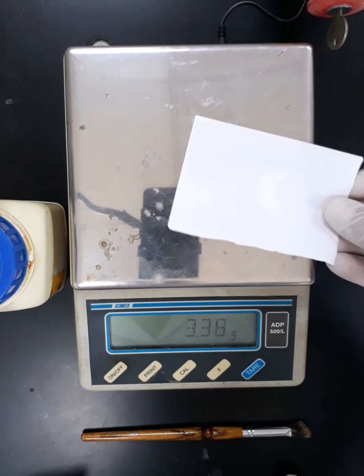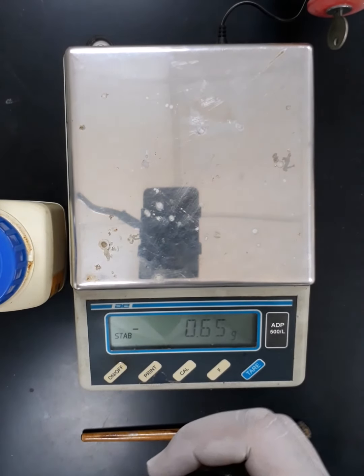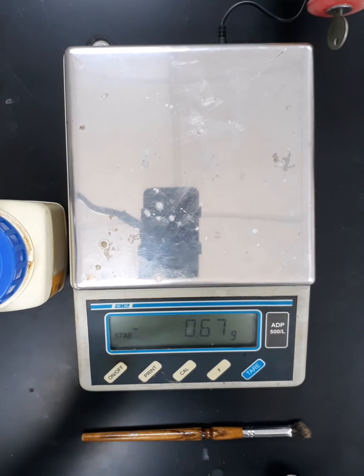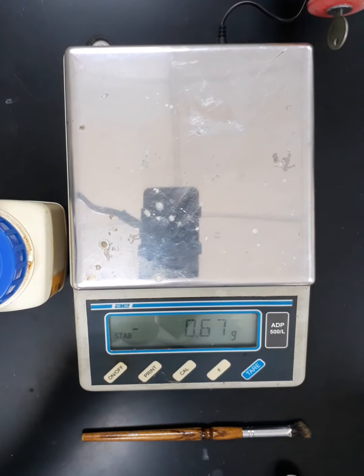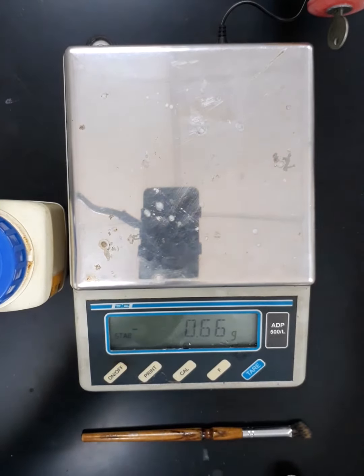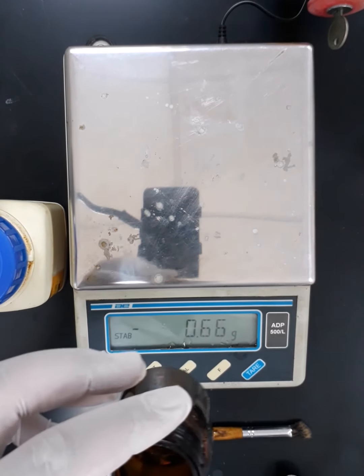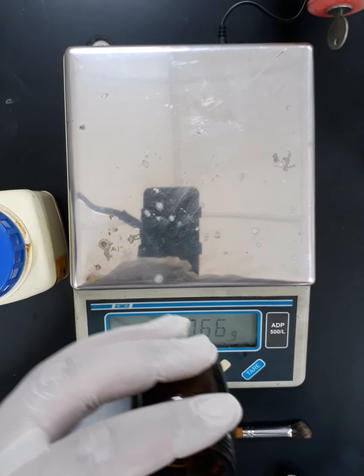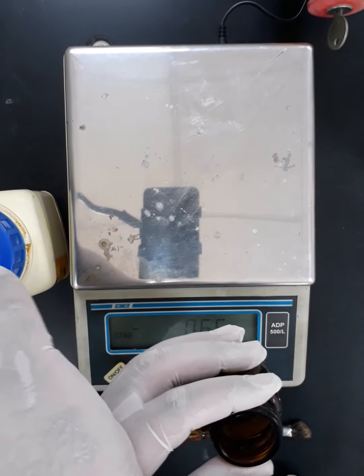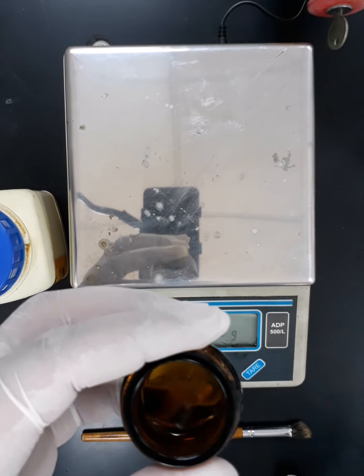Now we are going to transfer this amount into the container, and then we are going to add distilled water. We will make sure that we dissolve the quantity of the glycine inside. It's already soluble because it has a relatively high polarity compared with other amino acids.